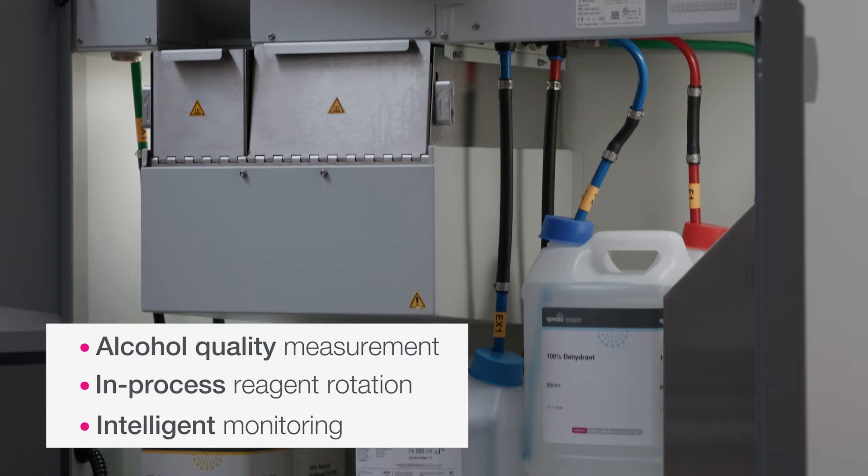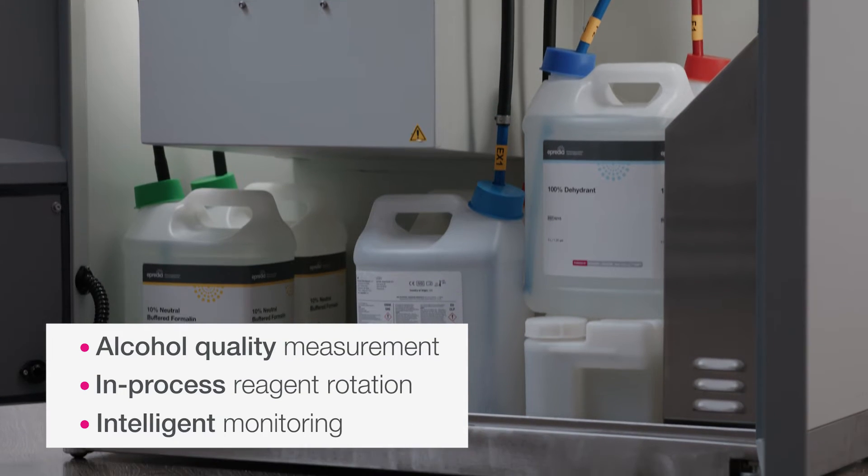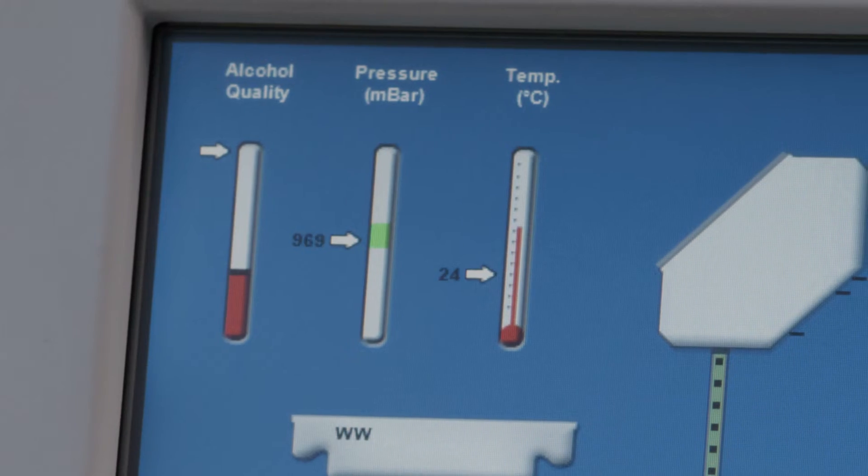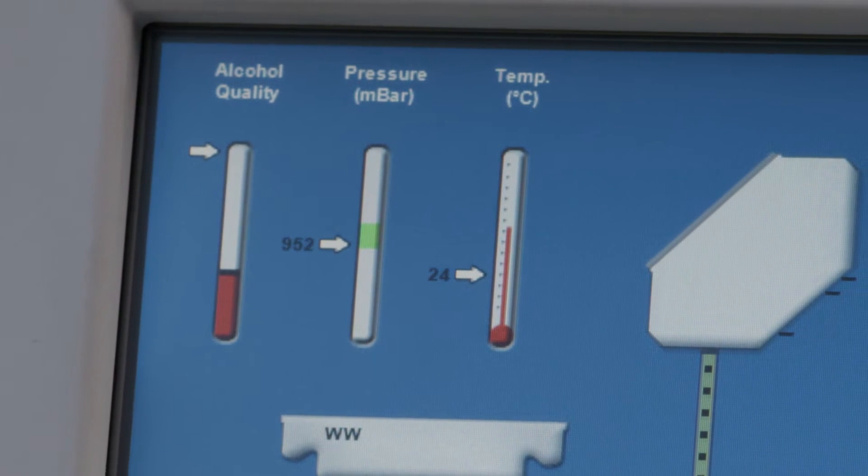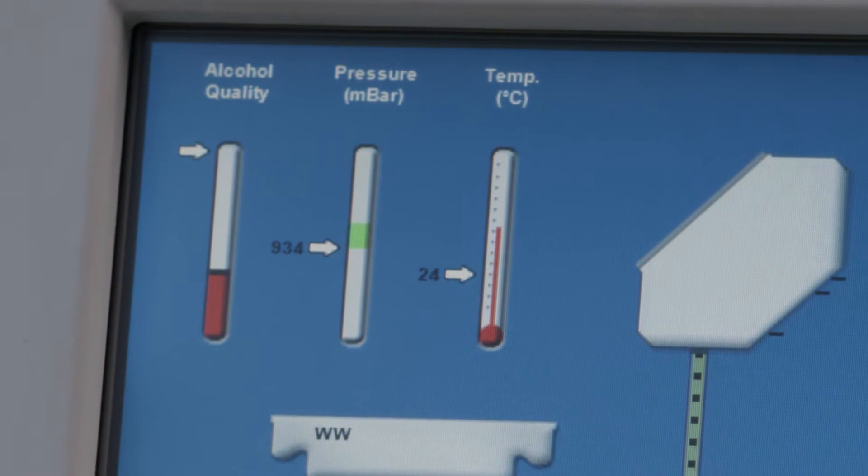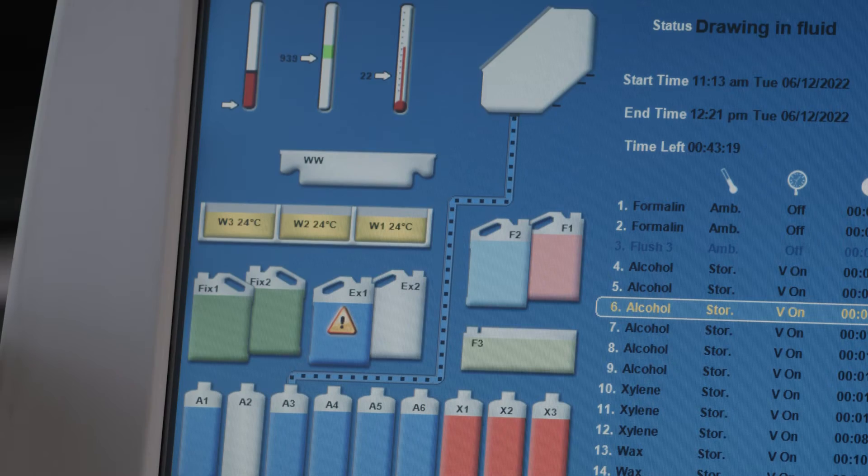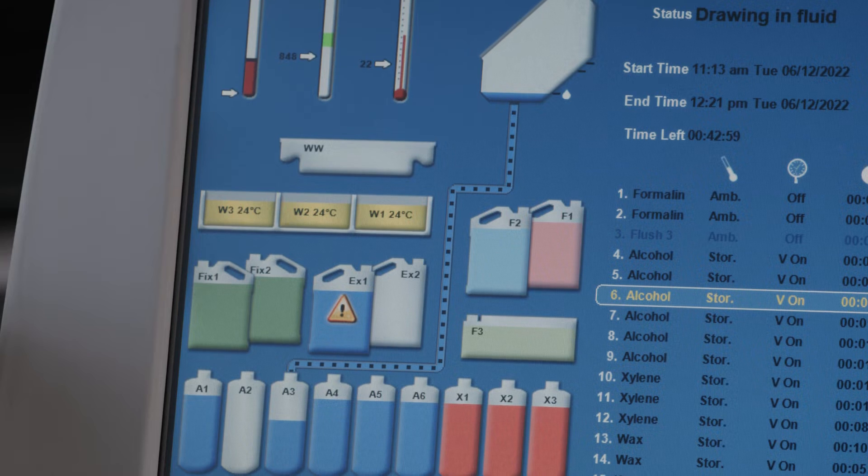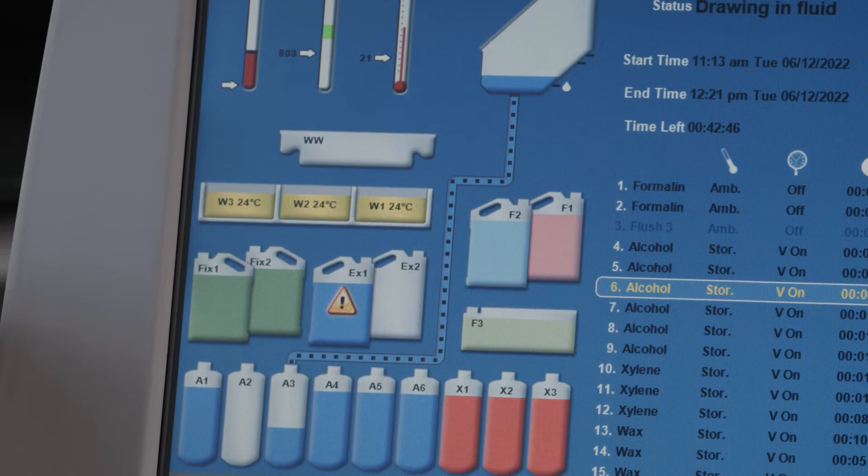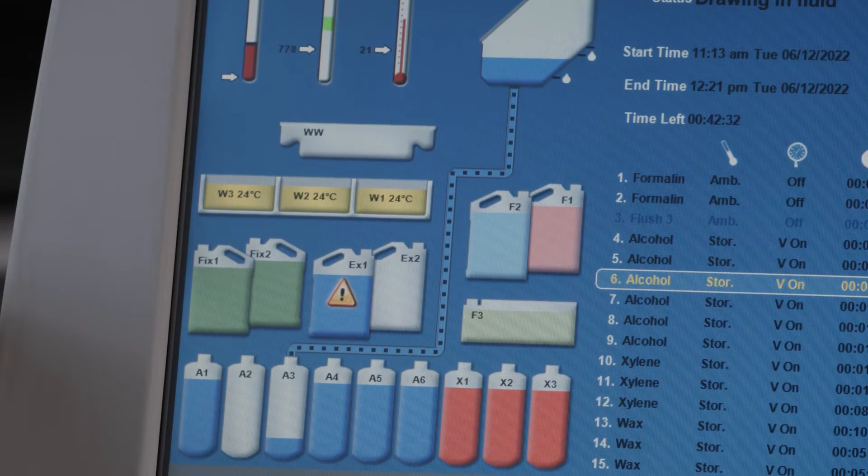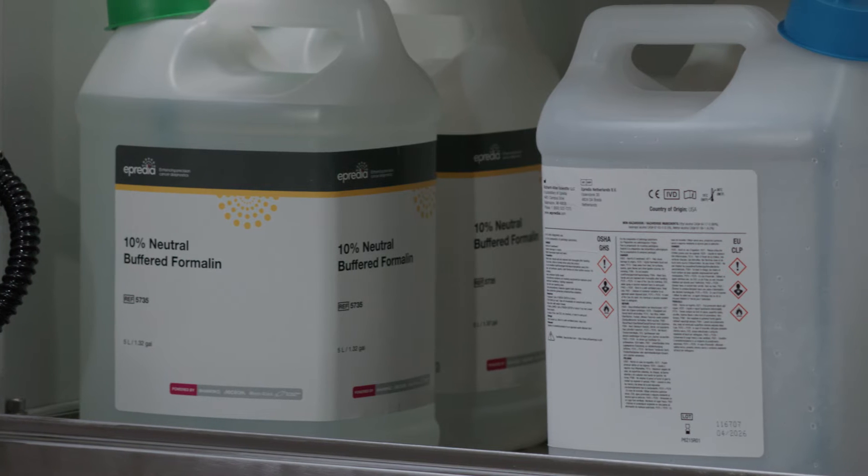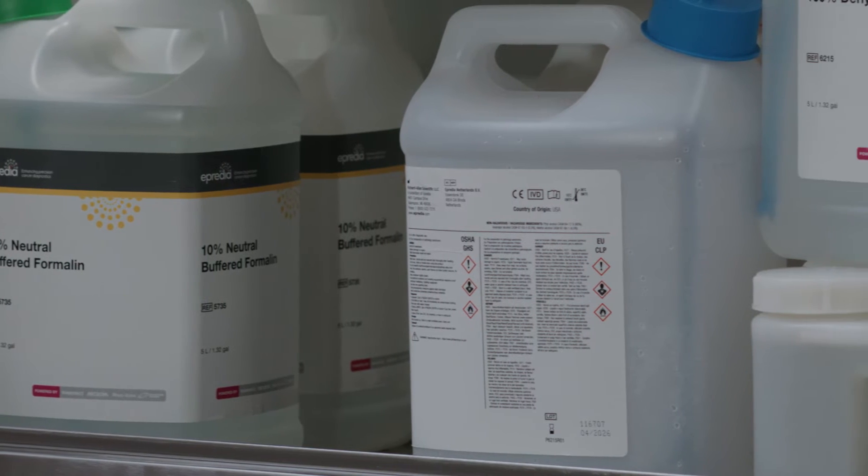The Revos Rotational Tissue Processor has an alcohol quality feature that uses specific gravity to measure your alcohol percentage after every run. It also prompts the automatic rotation of reagents for optimal tissue quality. This feature ensures that the alcohol is rotated at the correct time, extending the life of your reagents and providing significant cost savings each year that align with your budget.